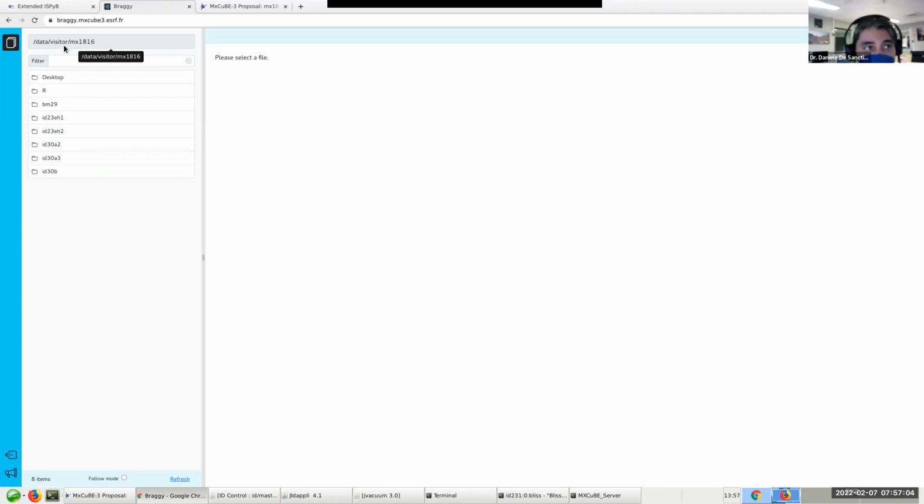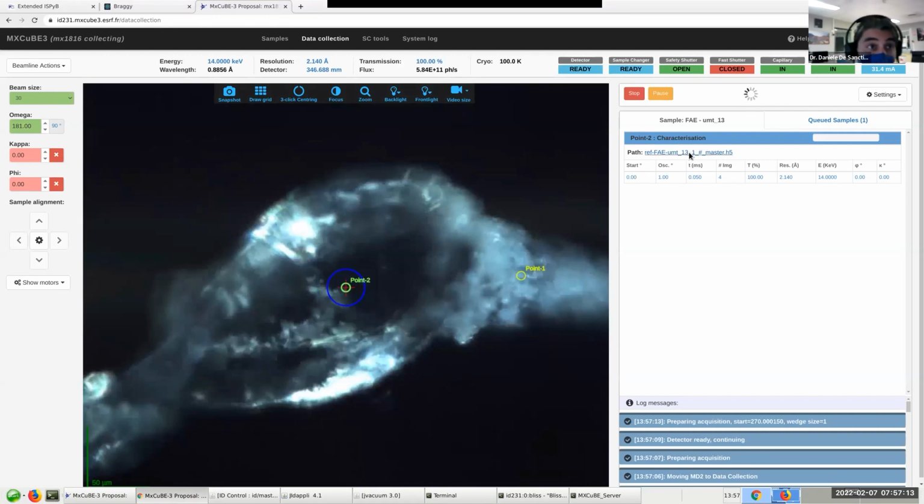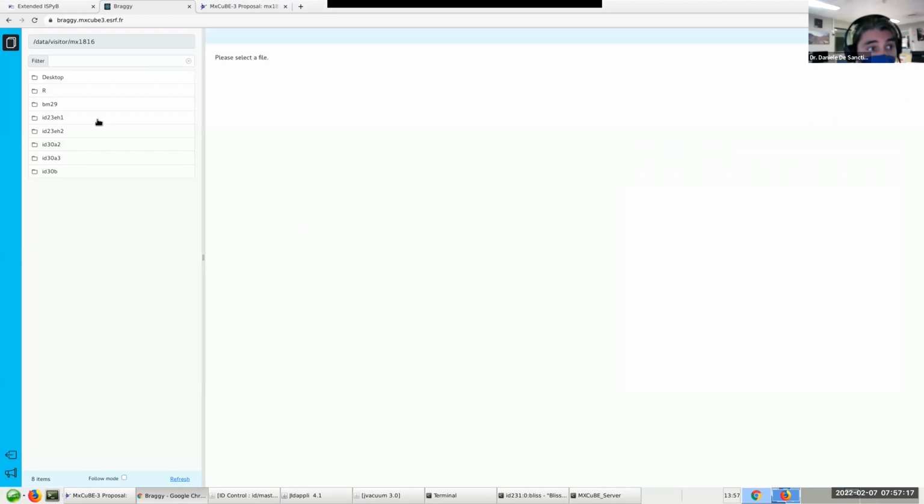So data visitor MX1816, which is our proposal. We plan for the future to add some direct link from MXCuBE to Braggy, but this will come only at a later stage. So let's go on 23.1, data of today, row.